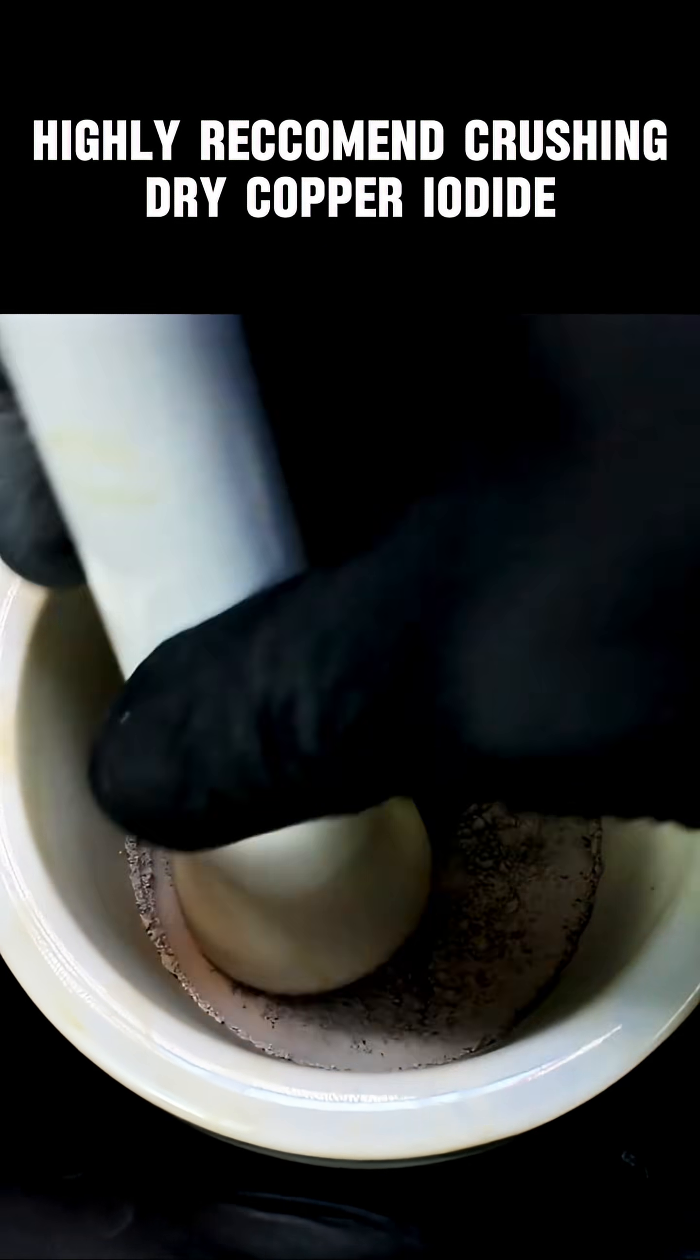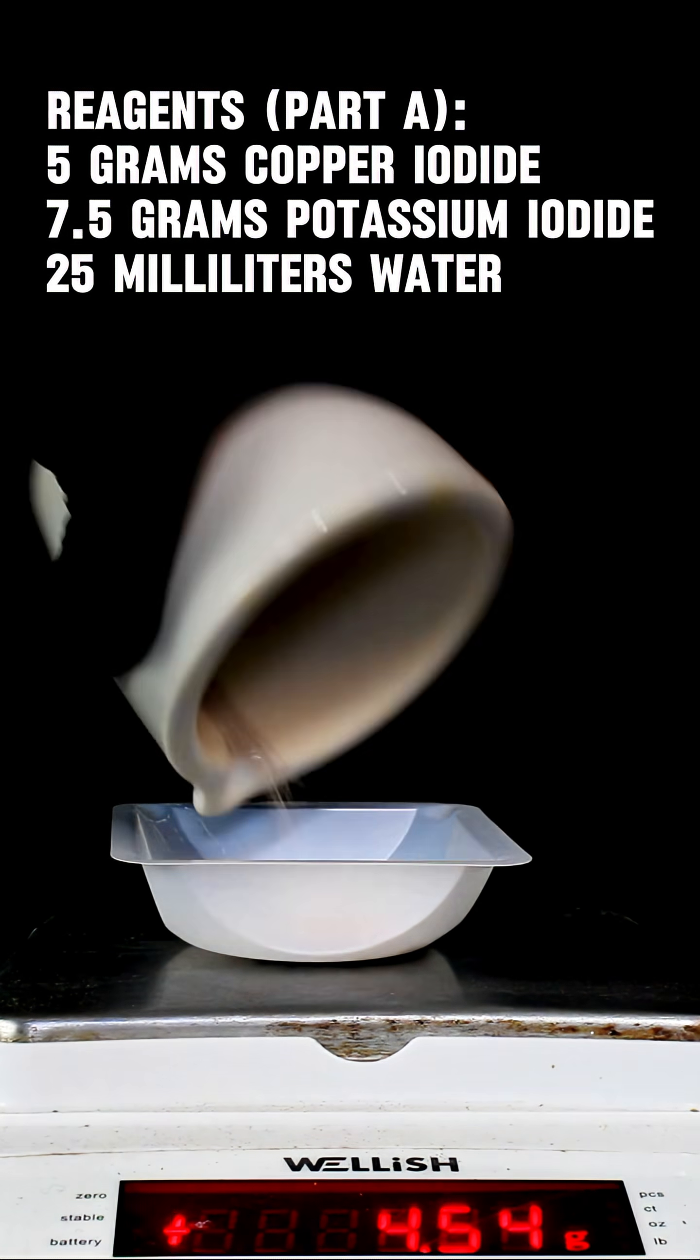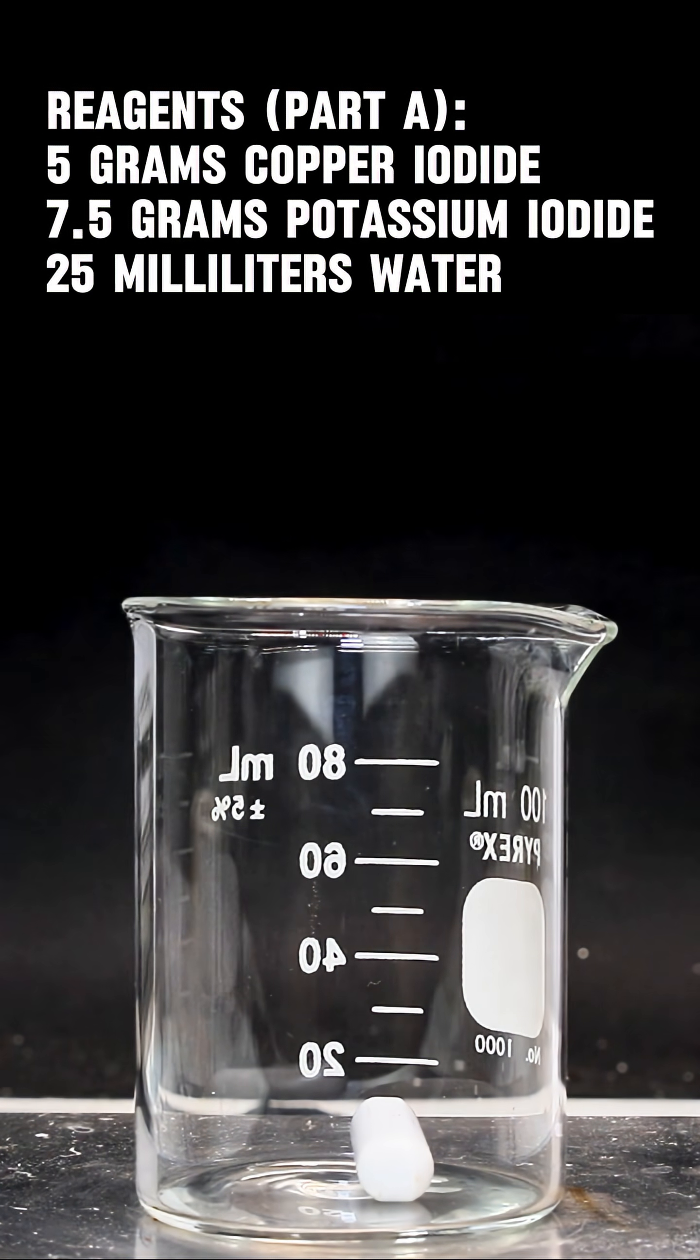Once you've got copper iodide, the next step is to combine it with excess potassium iodide to form a soluble copper iodide complex.